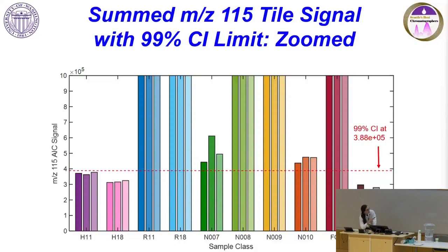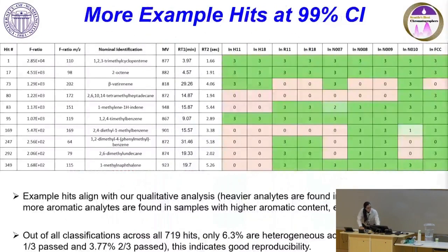We can also note that we do have some variation between replicates, and we could imagine potentially, and it does occur, in some other hits that we're trying to determine whether or not they should end up in the peak table, we might have cases where some replicates pass the p-test and other replicates do not. But that turns out not to be a major issue.